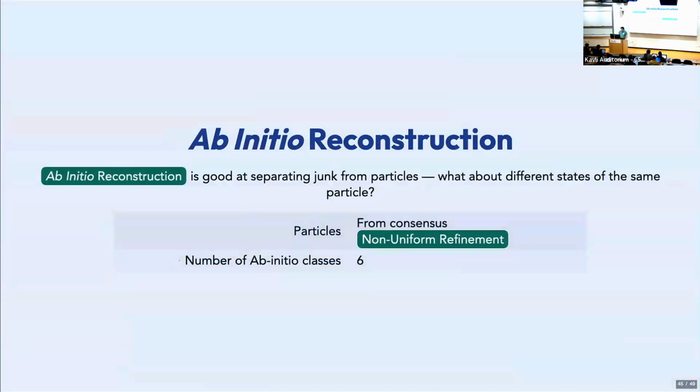So one last thing I want to show you here, and this is one that I may not have tried, but I just want to show it, is that we saw in other examples that ab initio reconstruction is pretty good at separating out junk. And sometimes it's separating out different poses or different orientations, right? So what if we had tried ab initio reconstruction here instead of heterogeneous refinement?